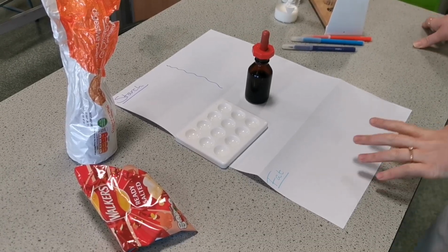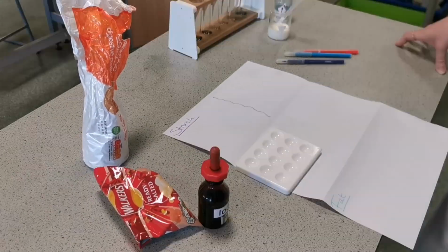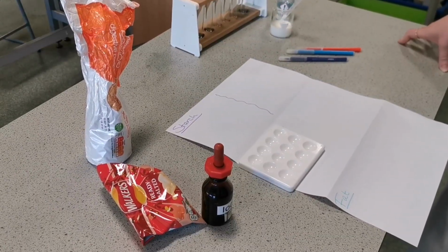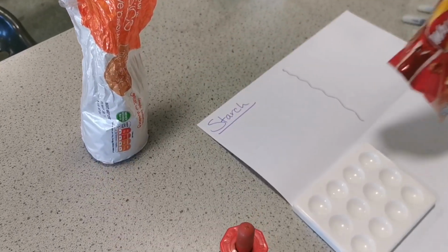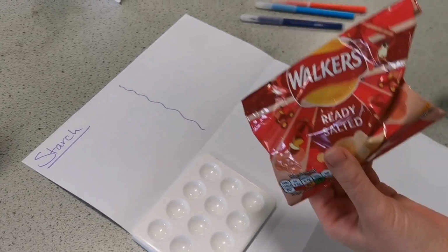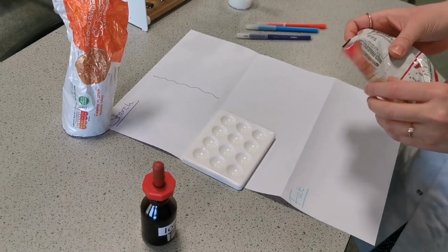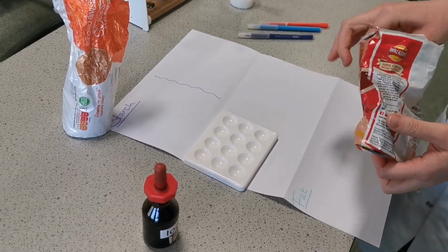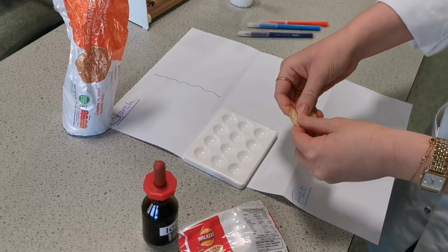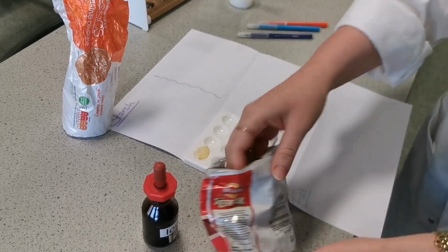The first one we are going to test is a nutrient called starch. Okay, the first food group we are going to test is something called starch. Now, we think we will probably find starch in things like crisps and in things like biscuits. So firstly, what we have to do is get a sample of these. You only need a little bit, and pop it in this thing, which is called a spotting tile.